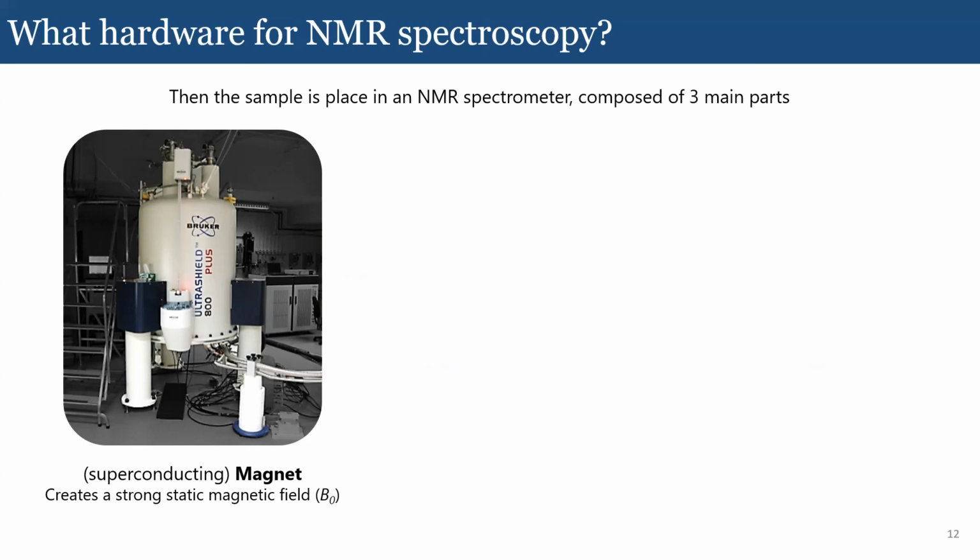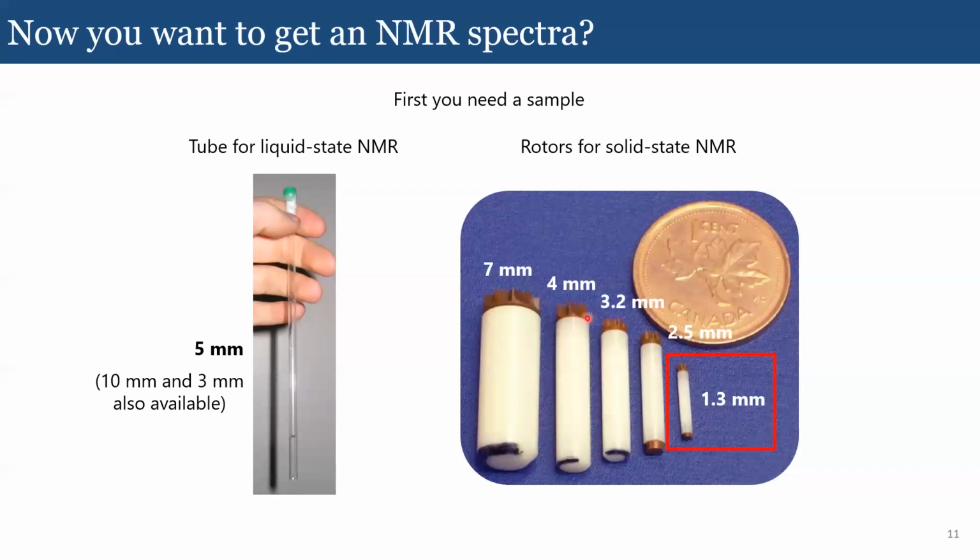The second part, and I'm going to explain more on that later, is that in solid-state NMR, if you look at the rotor, you see that these are caps.